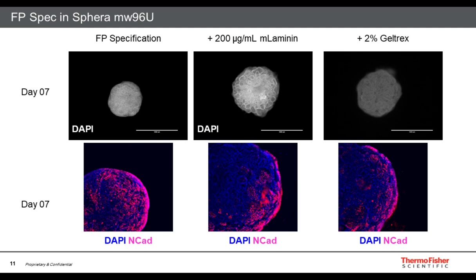We also looked at the structures by staining for the epithelial polarity marker NCADH. And we saw that extracellular matrix partially altered the distribution of NCADH into the lumens of these little bubbles or rosette-like structures. But it's not a completely black and white change.